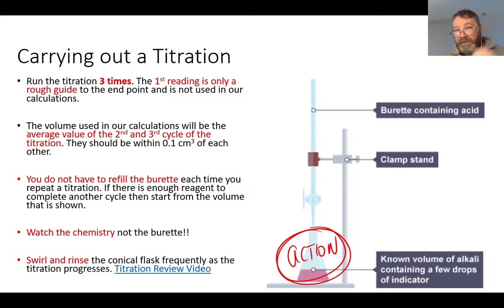So swirling makes sure the solution is homogeneous. There's no hot spots of concentrated chemical in there. It's all homogeneous. Now there's a video there that again I want you to watch yourselves. It'll take you through how to run a titration. It's extremely good. It goes into every detail of what you should be doing if you're running a titration. So you can pause now if you wish. You can click on that link on the slides and that'll bring you to the video and you can watch it.